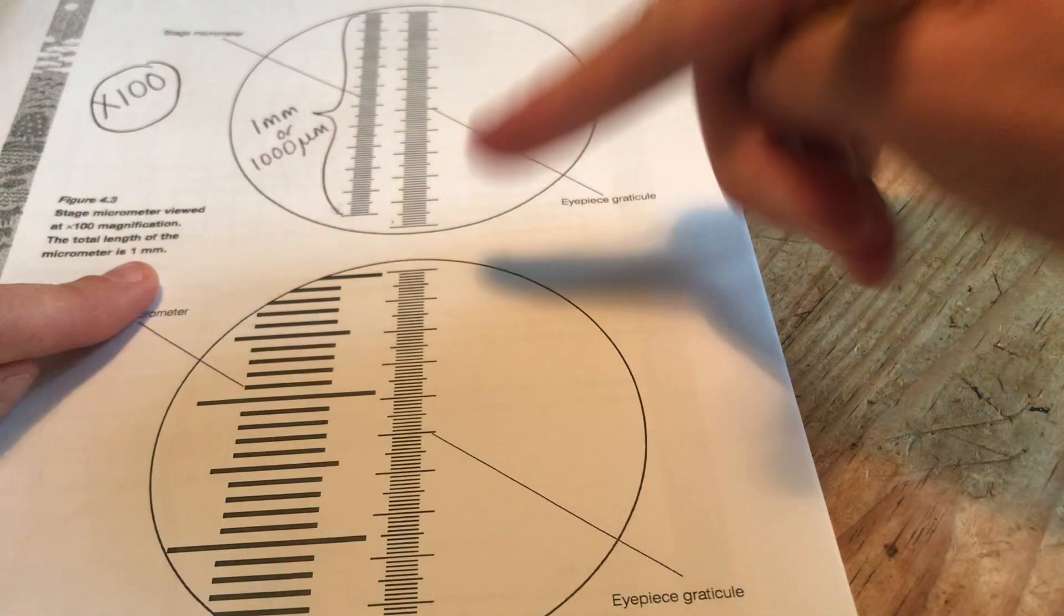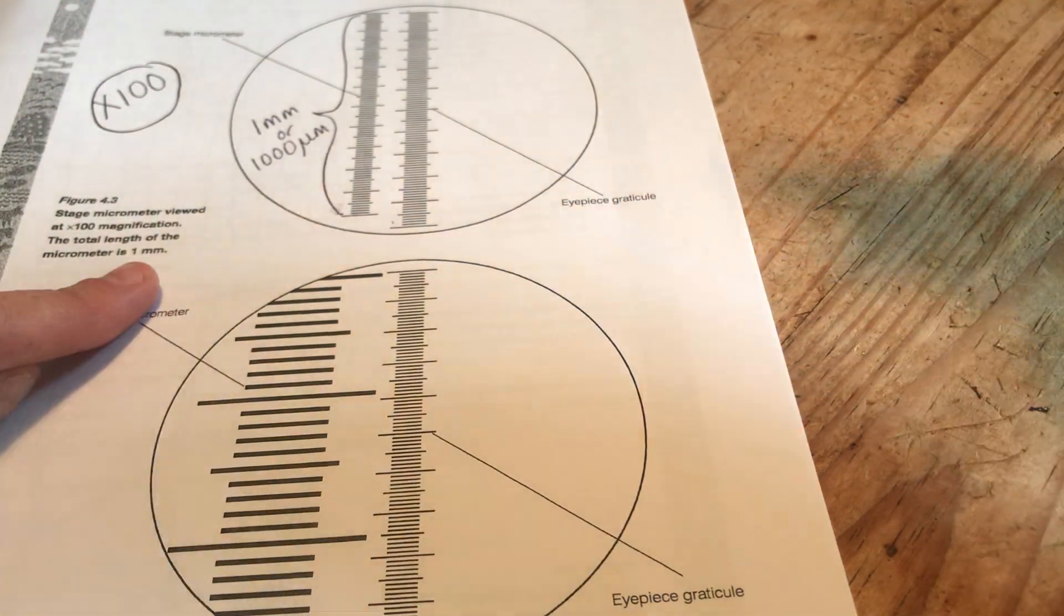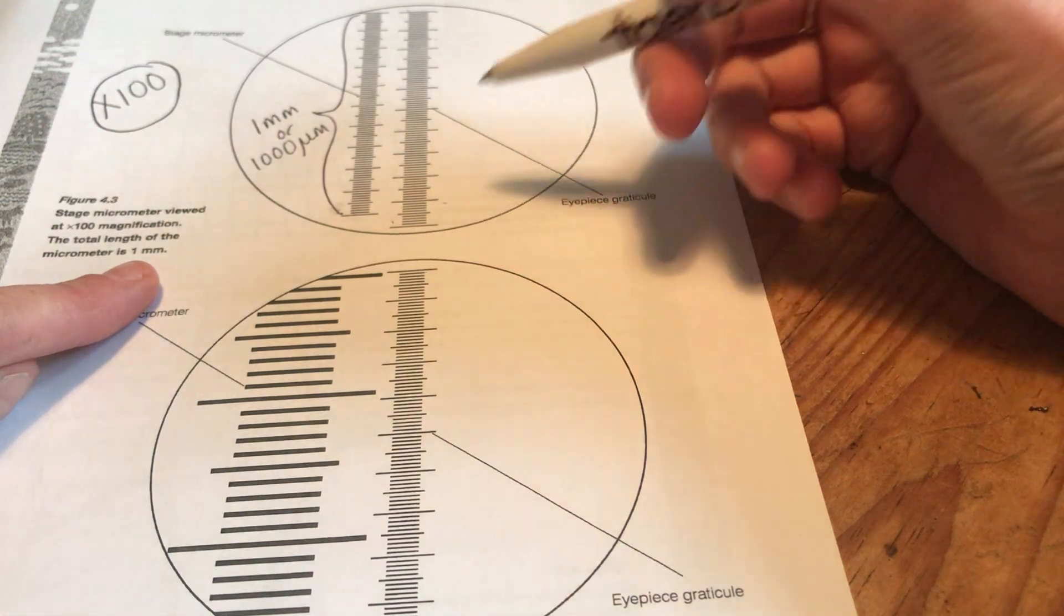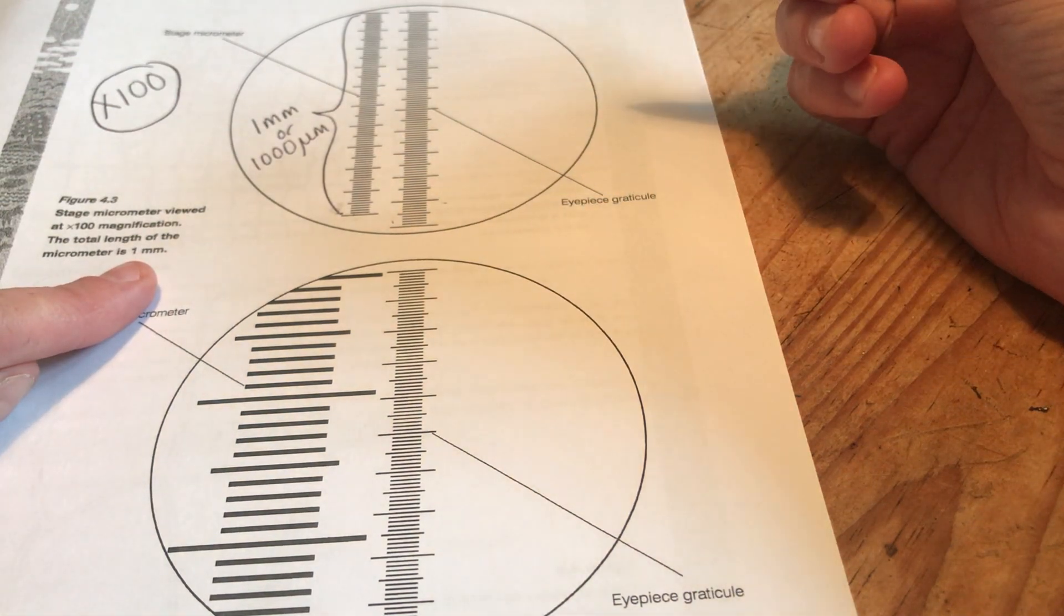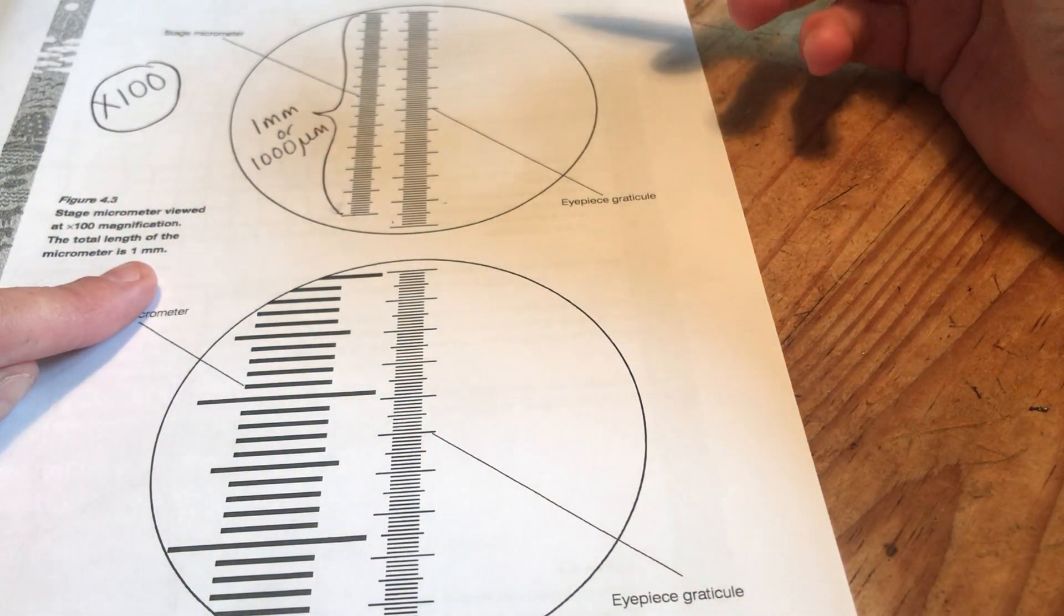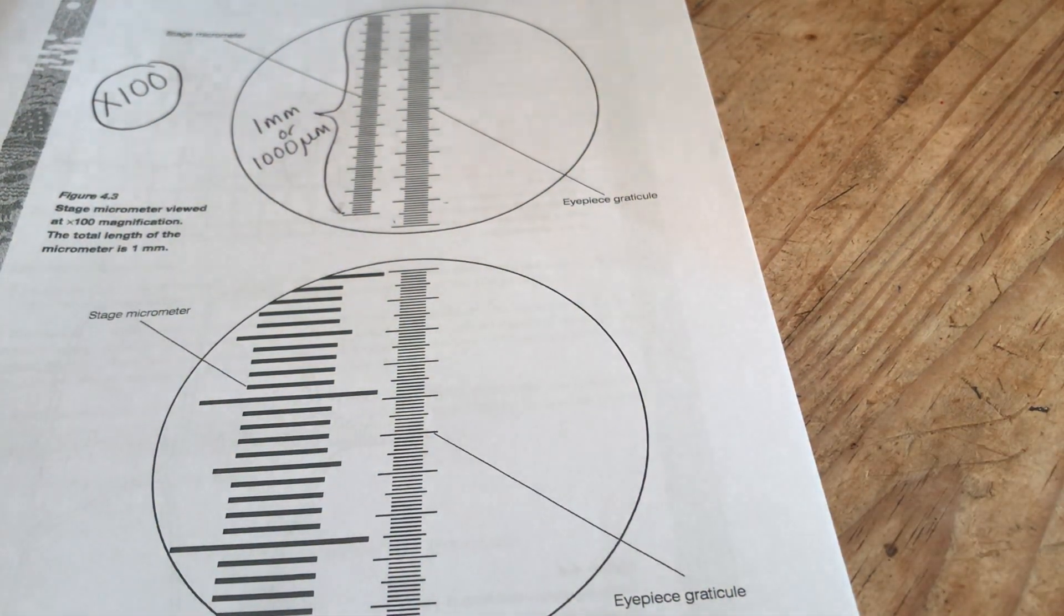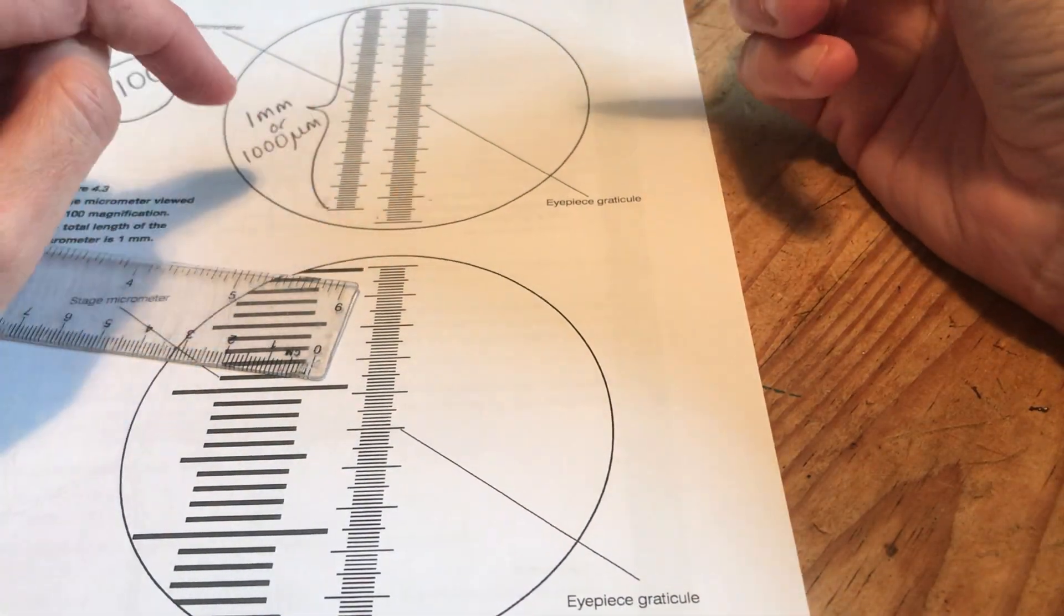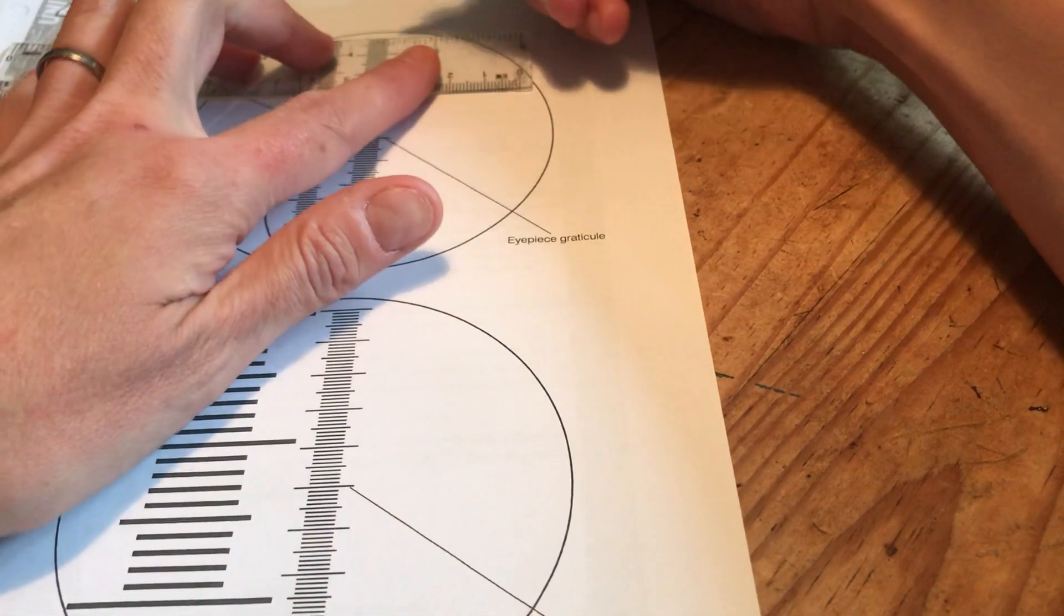Here's the eyepiece graticule. Remember an eyepiece graticule scale is not actual measurements it's literally just lines. You need to know how much each of those lines is worth in terms of a distance at different magnifications. So this is what you need to do. You need to take a ruler and you need to line up these two scales.